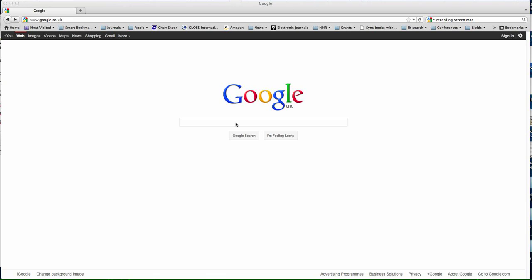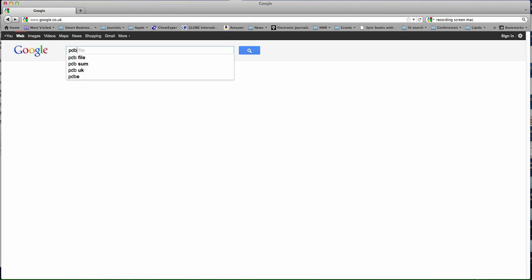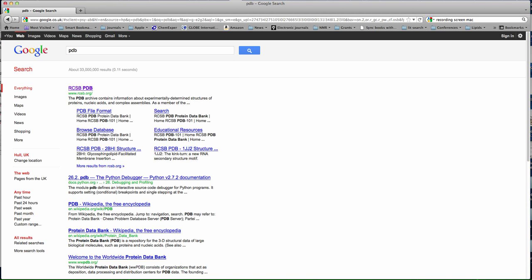First up, we're going to take a look at the Protein Data Bank, which is the resource where all protein structures are deposited. Simplest way to find it, just Google PDB Protein Data Bank. There's your top here.